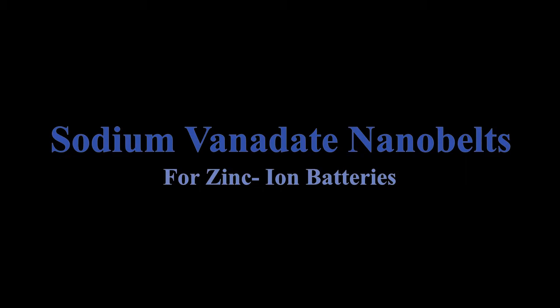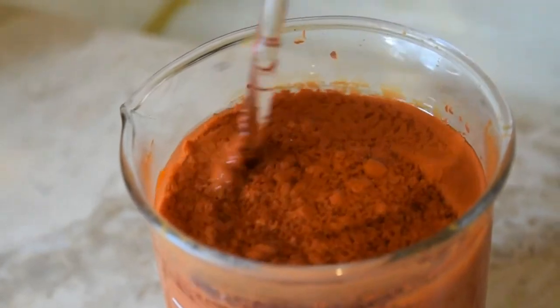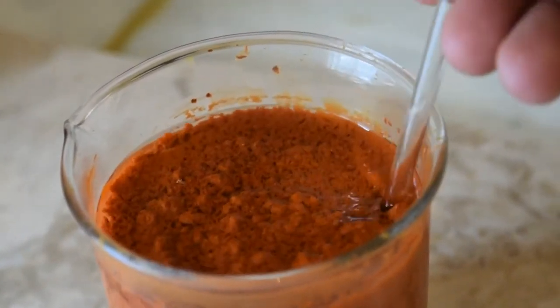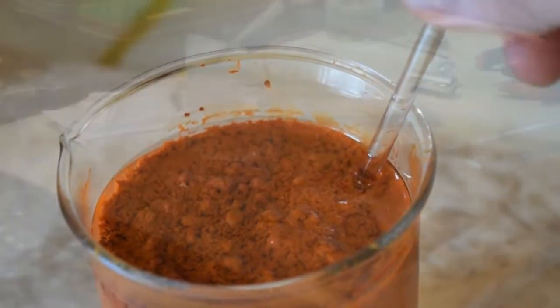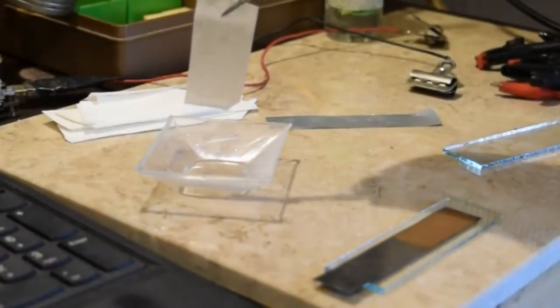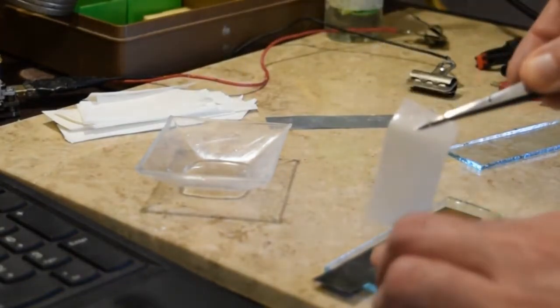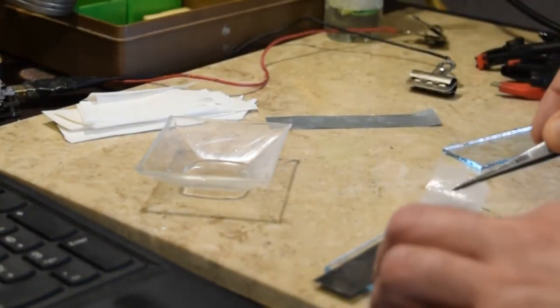In this video I'm going to show you how to make sodium vanadate nanobelts as a cathode material for zinc-ion batteries. It exhibits good energy density and cycle life when using a combined zinc sulfate and sodium sulfate water-based electrolyte. Making it is relatively straightforward and within reach of many home experimenters.